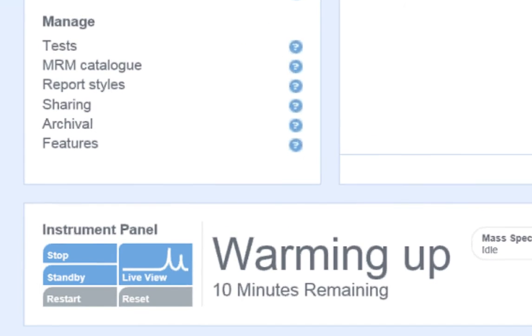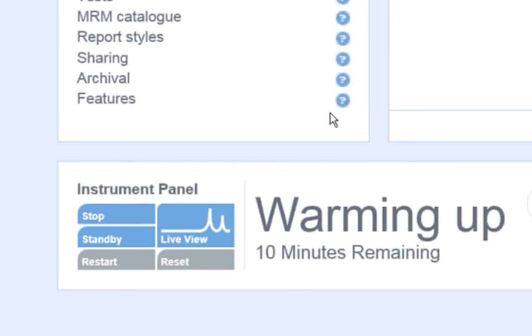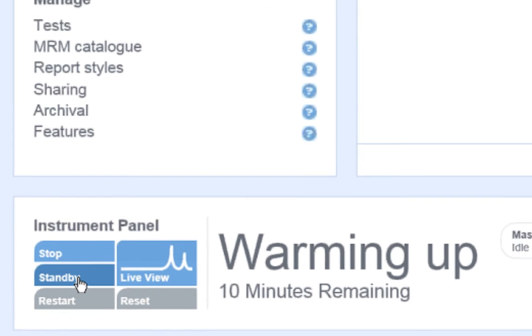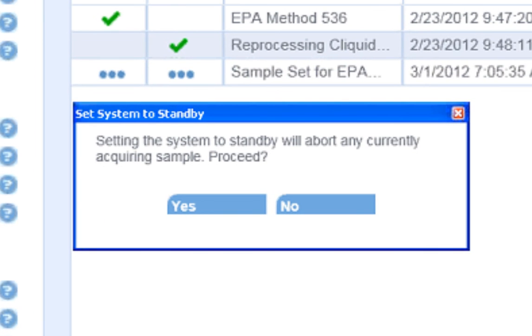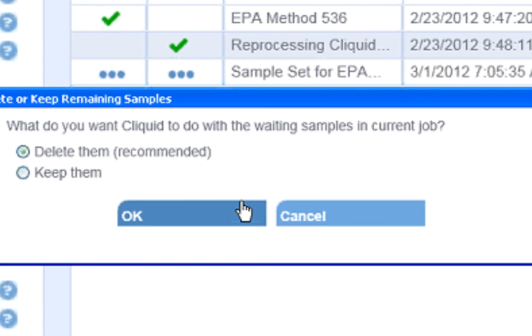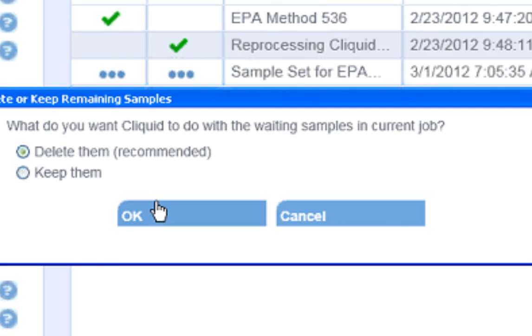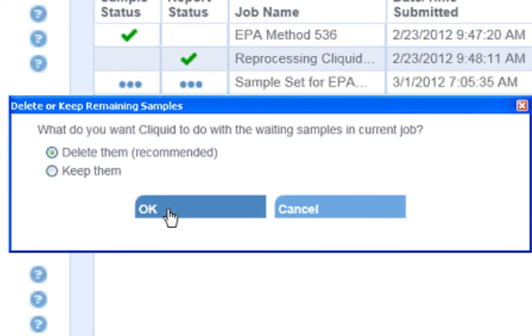If I would like to stop my samples from running, I can simply click the Standby button on the instrument panel. This will turn off the voltages on my mass spectrometer and stop the flow of my LC. In addition, the software will ask me if I would like to delete the samples that are pending for analysis. I will select Yes.